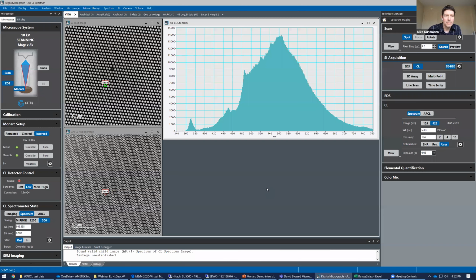That's what I'm trying to understand. What do you mean by the field of view? Field of view of what? So this is my field of view here. When I say field of view, I guess I interchangeably mean the region from where the light is emitted and efficiently collected back into the system.